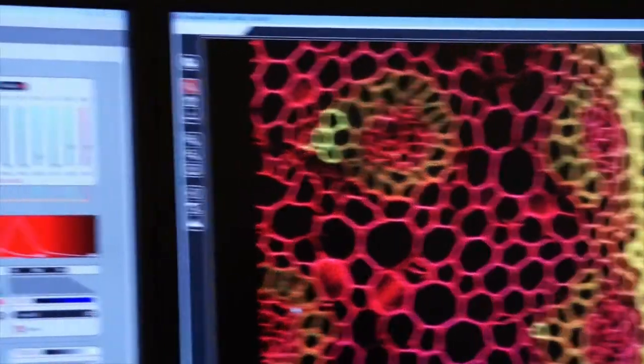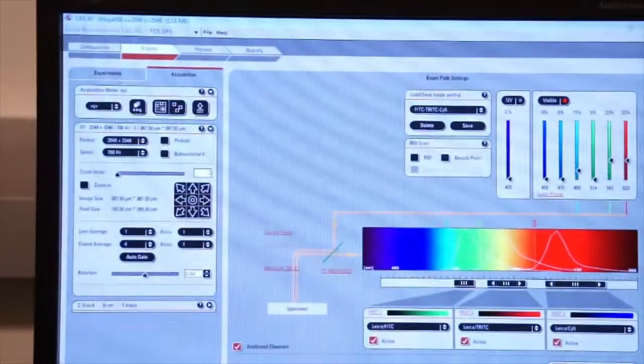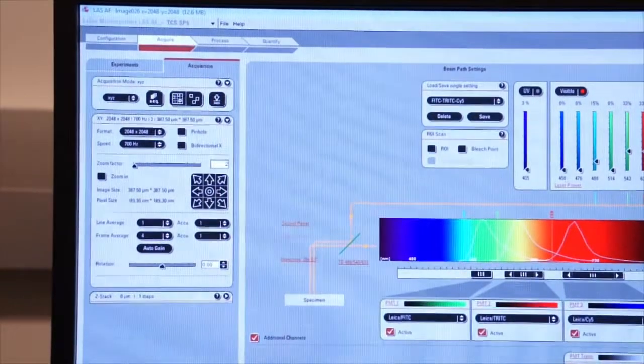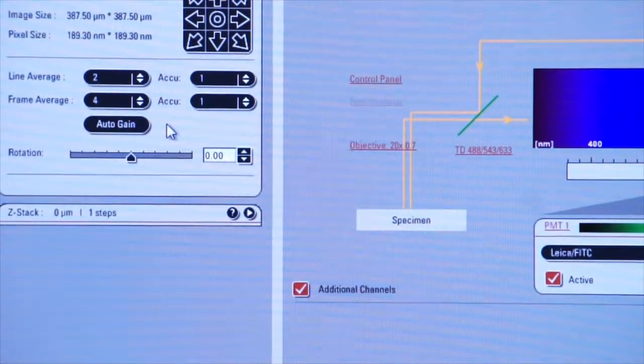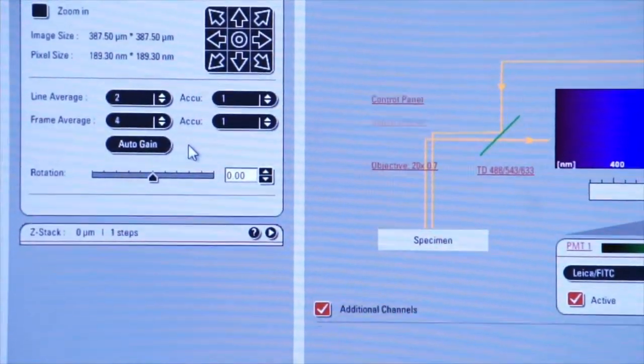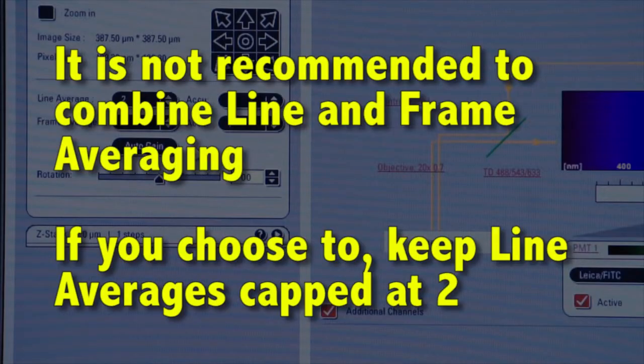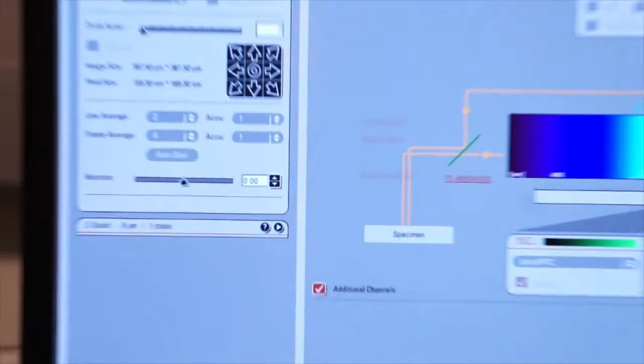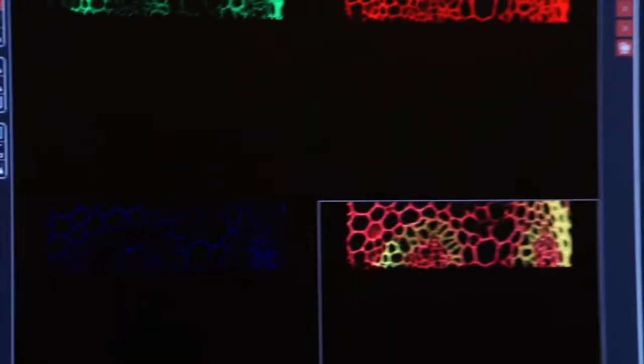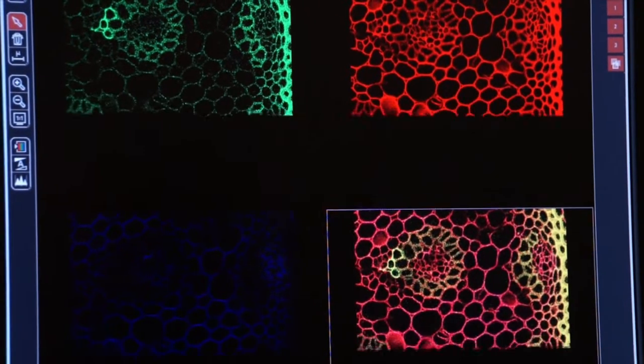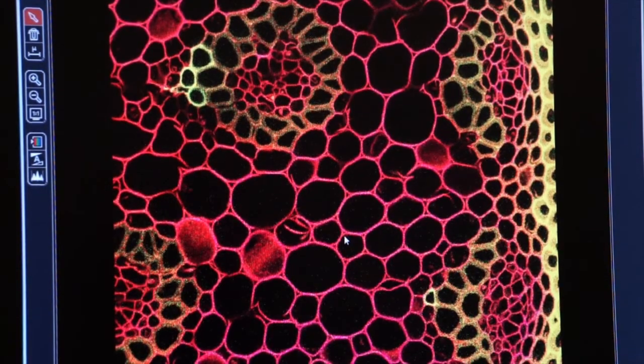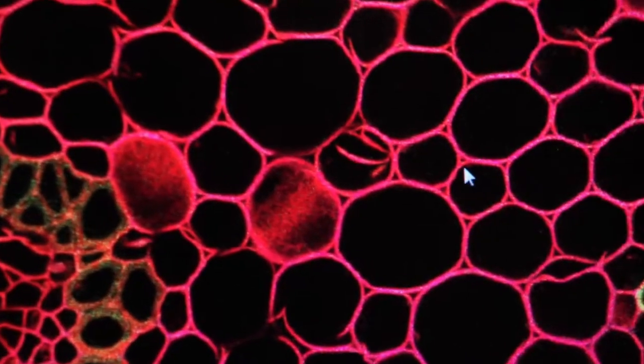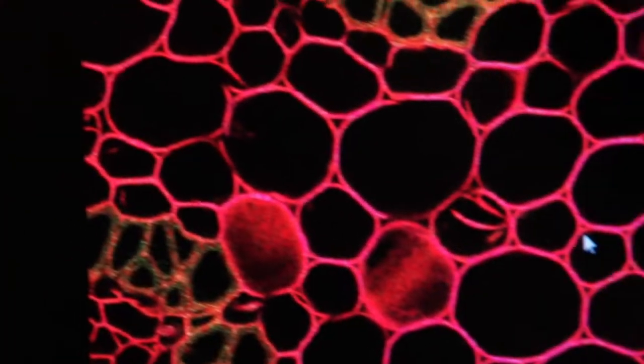Here you see on our composite image it's still a little bit pixelated so we can improve that by doing both frame and line averaging. I don't recommend that you do both and if you do I would say only select maybe two scans per line and more scans per frame. So let's click on capture image. Watch the image on the screen. Again there's always trade-offs and here you see it's become a little more pixelated again. We see some pixels in here but it's still scanning so some of those pixels will go away over time.